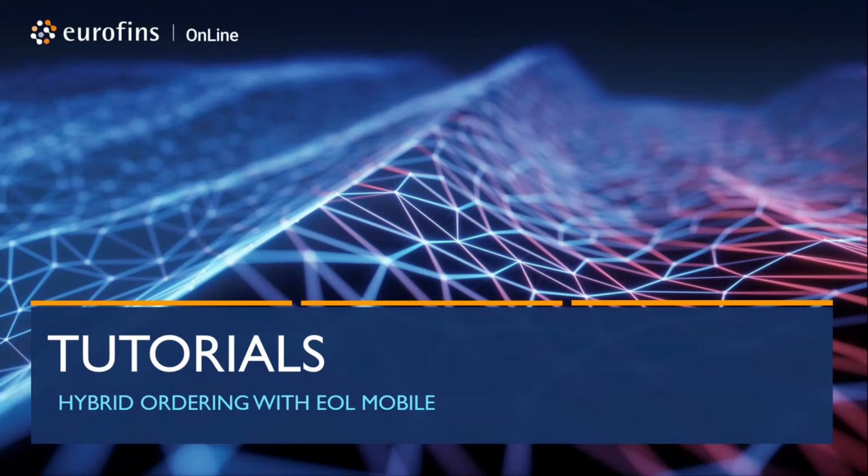This is the second session in the series, and today we're going to talk about hybrid ordering. Hybrid ordering is one of the key talking points, or the key features, of EOL Mobile and allows for great flexibility for sample takers and consultants.